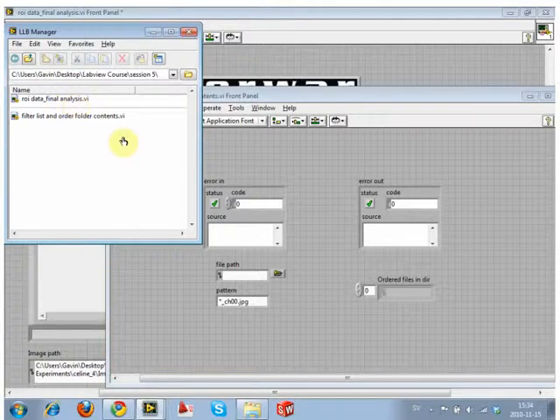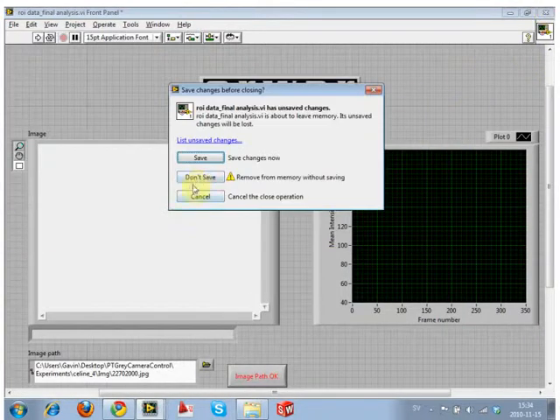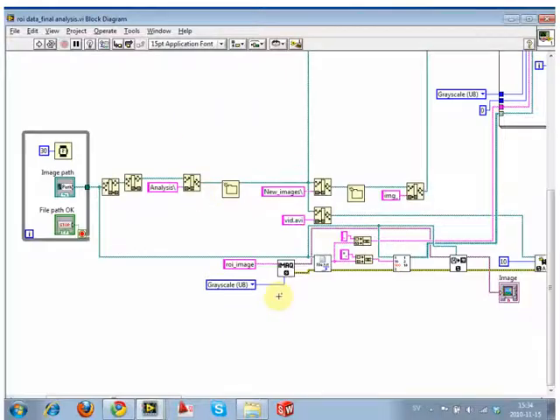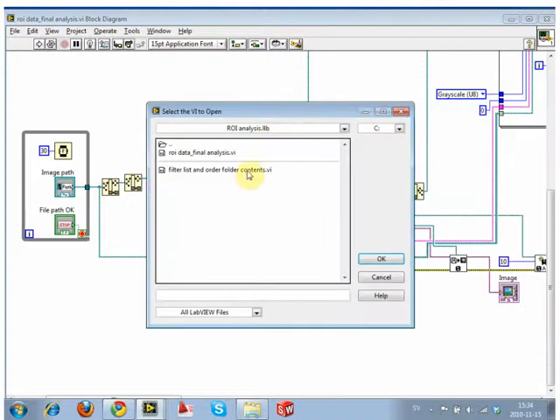Then when you're in this, you can redirect the links to the library file. So right now, I've got this file open, so let me close this file off first, and then don't save. Okay, but this one right now is pointing to some place on my hard drive in the sub VI folder. What I want to do is point it to the library file. So you have to go to replace all callers, select a VI, and then point it inside the library file.